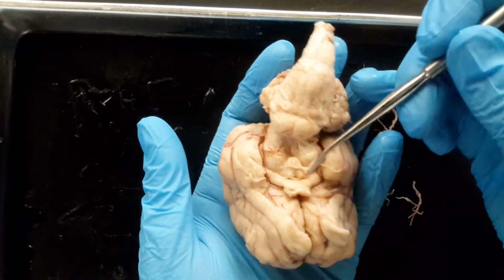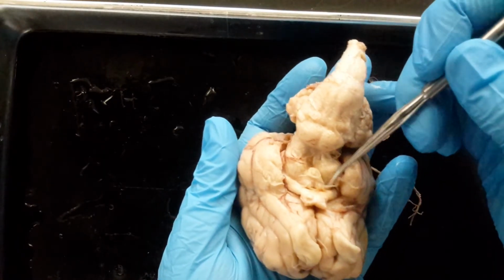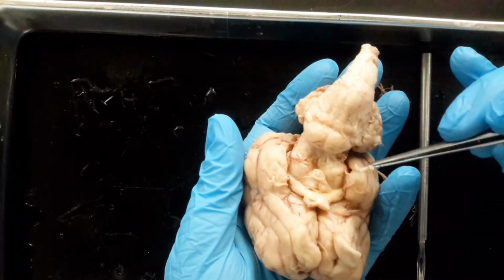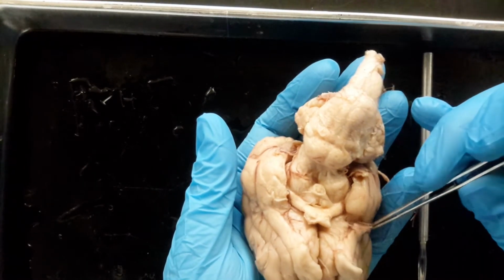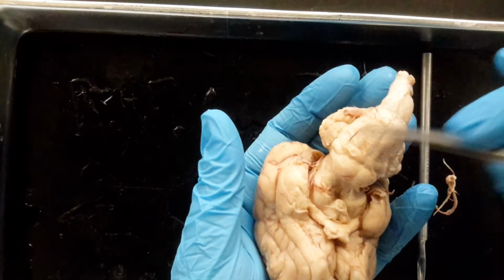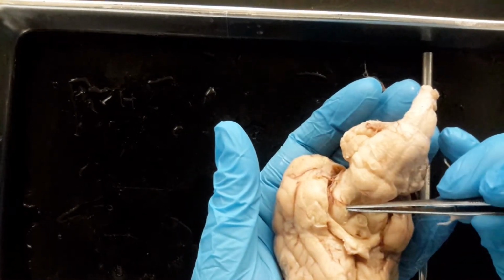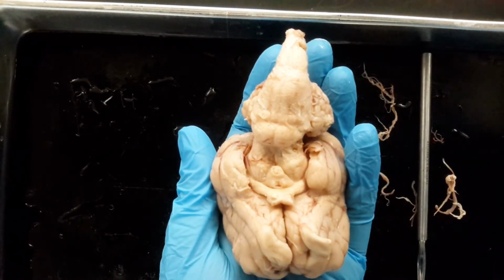So right here, I'm getting my probe up underneath the pia mater, so you can see that's a membrane. And what you can do is, once you get a nice little bit of pia mater, you can use your tweezers to gently pull it off, but you have to be careful with tweezers, because if you get a little too aggressive, you're going to start tweezing parts of the brain off. And it happens. It's a different type of tissue than most of you have worked with before. So the goal is to clean the inferior portion so we can see some of the anatomy better. So really quick, I cleaned around the optic chiasm a little bit.